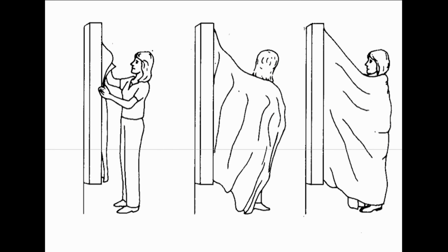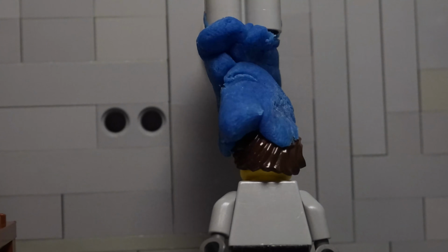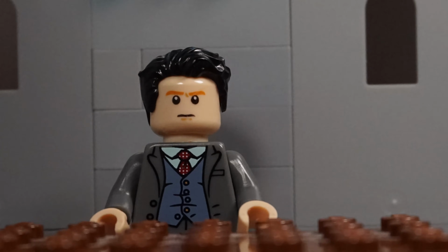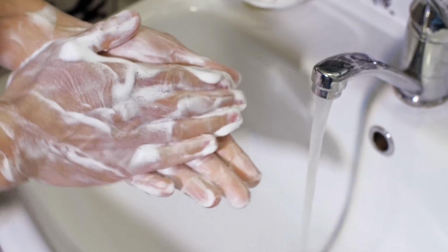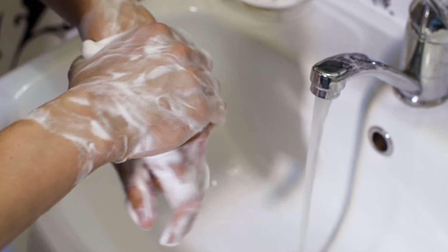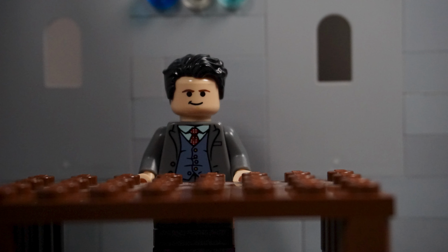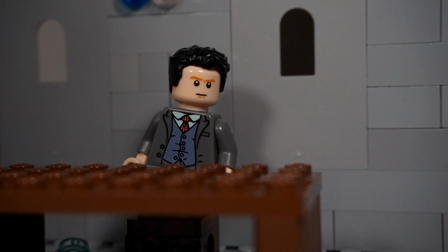The fire blanket is used to smother flames on a person, and this is done by wrapping the blanket around you. In case dangerous chemicals are spilled on the skin, tell your instructor immediately, and use the water shower if it lands on large amounts of skin or clothes. Even if only a small amount of chemicals are spilled on somewhere, like your hands or anywhere on your clothes, wash them as soon as possible and let your instructor know, even if the amount spilled seems insignificant. If chemicals spill in the laboratory, clean it up with help from your teacher as soon as possible to prevent any potential damage. Before starting any experiments, always first prepare the lab with safety equipment and remove any unnecessary things from the area where you work that could cause damage or prevent quick treatment.